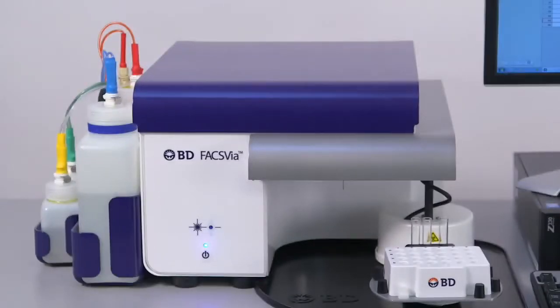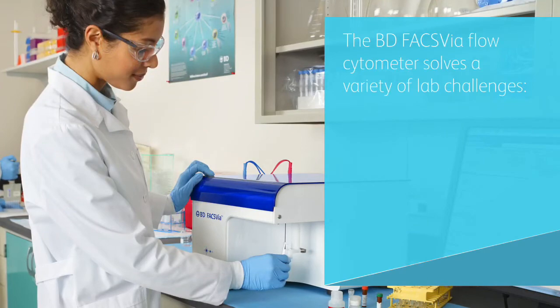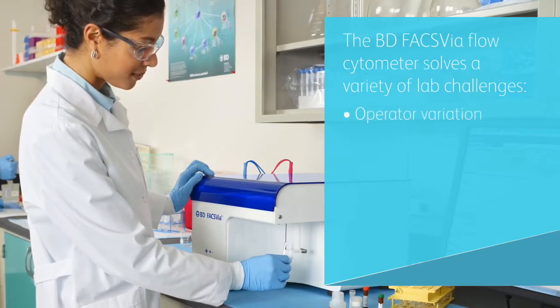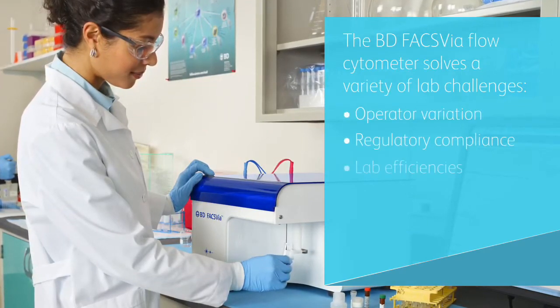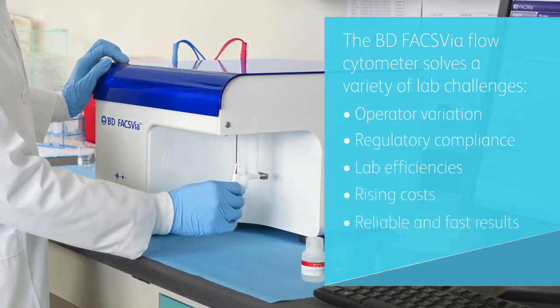Welcome to a tour demonstrating how the BDFAX VIA system can help you solve a variety of lab challenges, from operator variation, regulatory compliance and lab efficiencies, to rising costs and providing reliable and fast results.